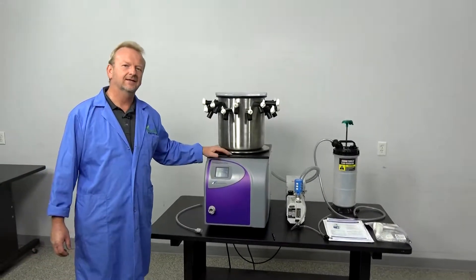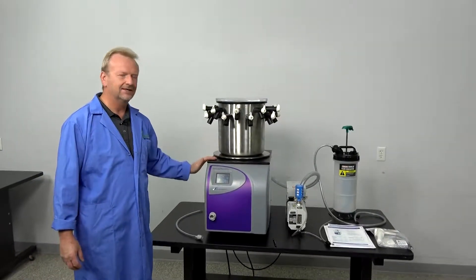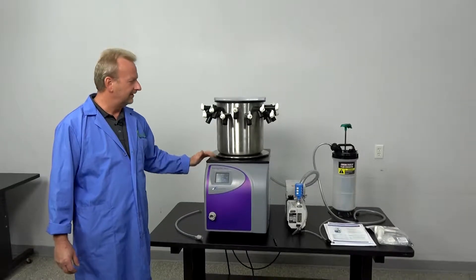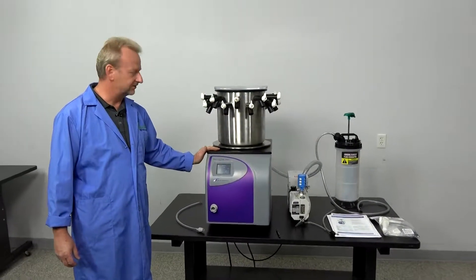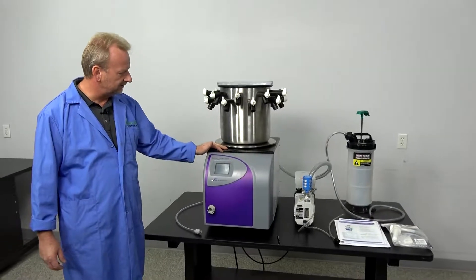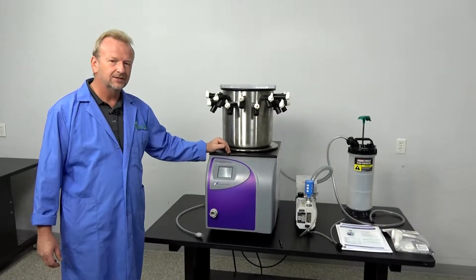Hi, I'm Rich with New Life Scientific and today I want to show you a really nice benchtop freeze dryer. First time I've ever had a new one as new as this one is. It's a 2016 model but just in excellent condition.